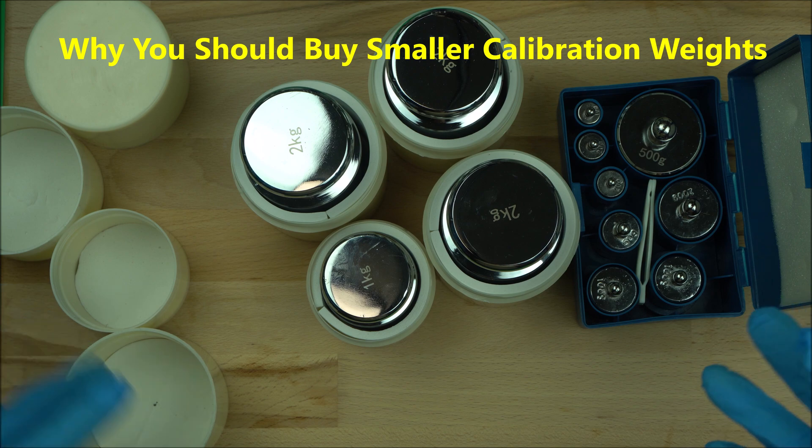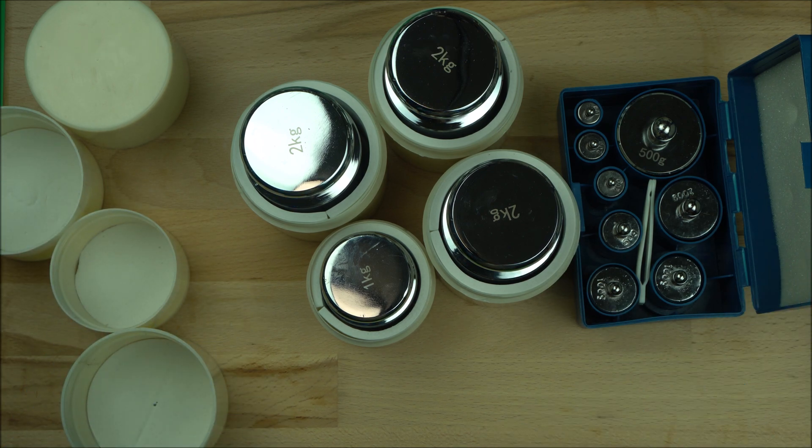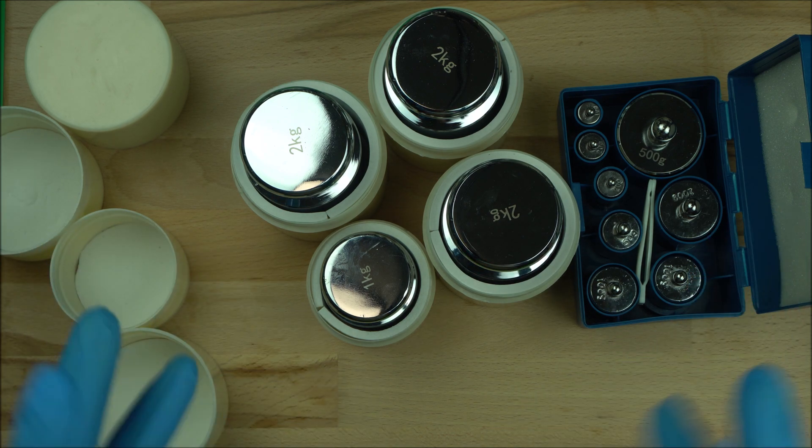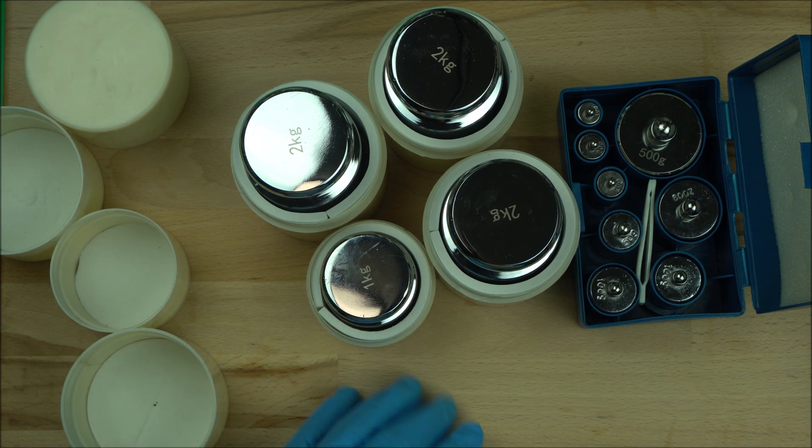Why do I buy my calibration scales in smaller amounts? I'm doing this to save money. Because if I have to buy the big one, like 5 kg or 6 kg, it's more expensive. Because big brands are now selling that and it can cost you up to $600 and something. So you have to be wise in your spending if you want to make the most of cosmetic formulation.